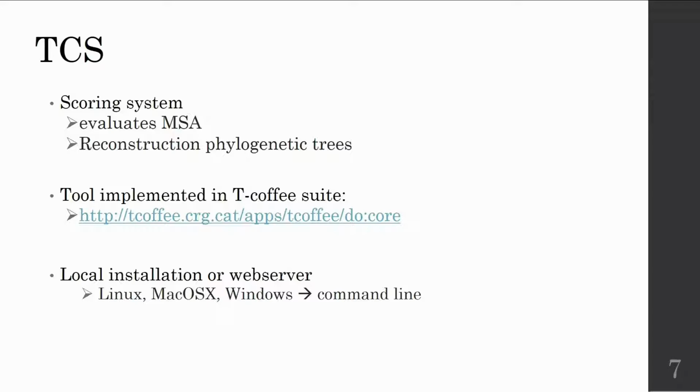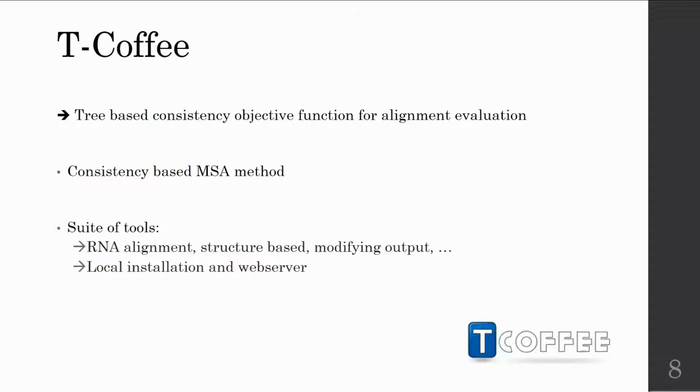In this example, for the research question, I will use the web server. If you install it locally, you can use it through the command line. Now, what is tCoffee? Because TCS is an extension of tCoffee, I will discuss a little bit about tCoffee.